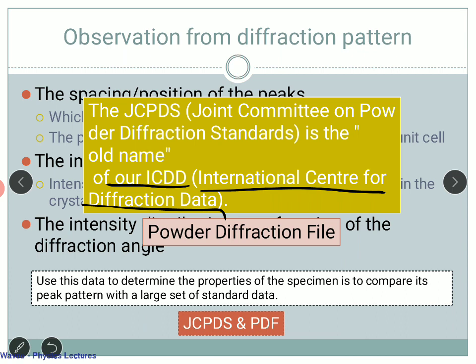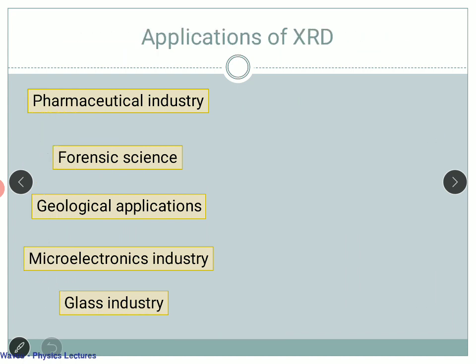Basically, it comes with your XRD machine, or you have to buy it separately, because this is a very well maintained and widely accepted diffraction database, which can be used for references and even for publications. Okay, that is important. Now, what are the applications of XRD?